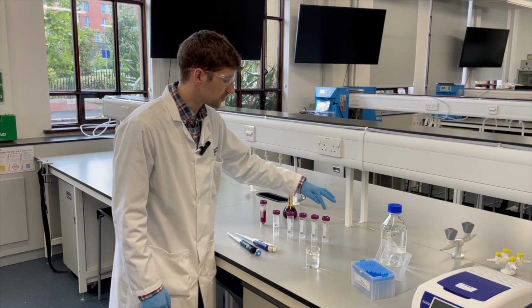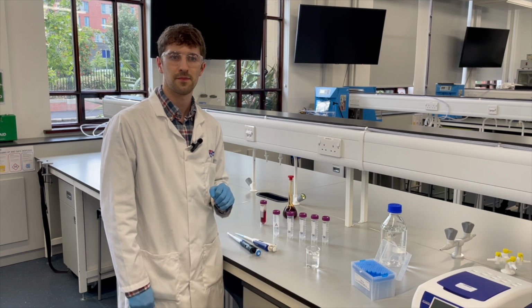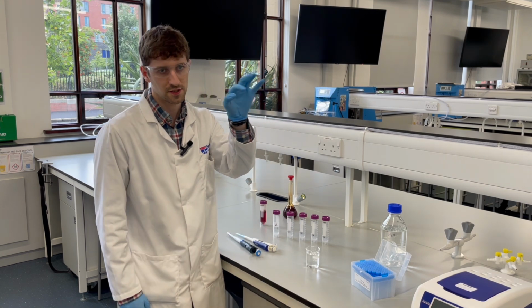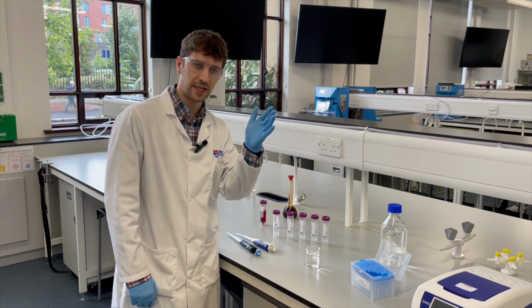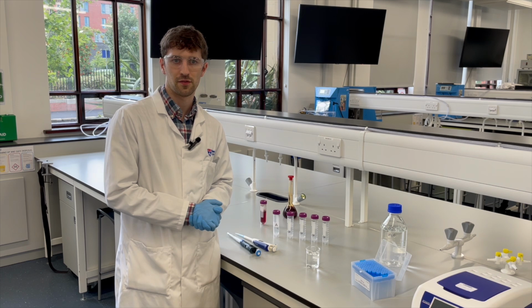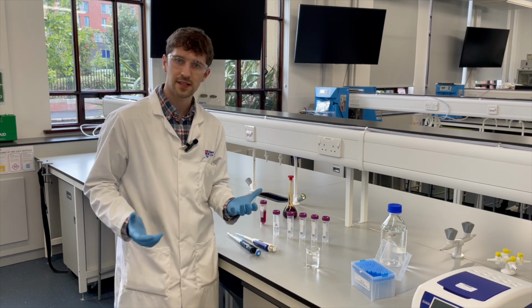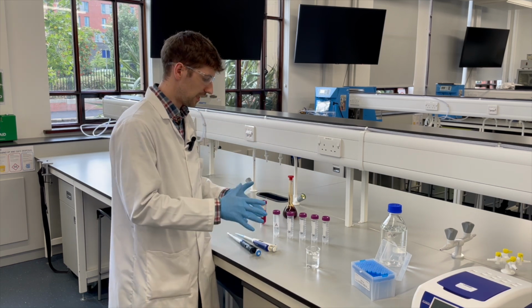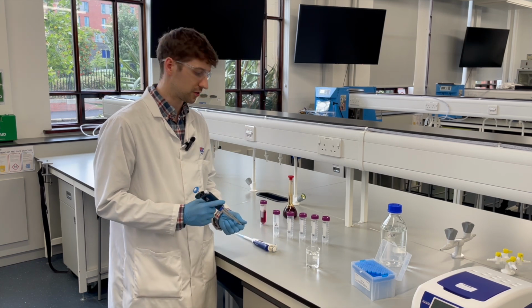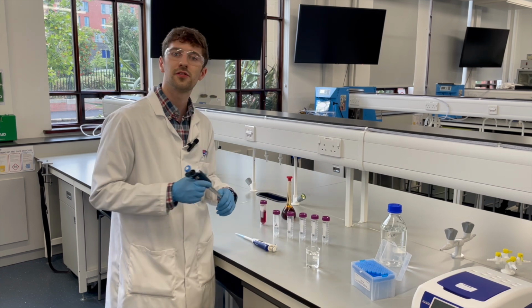And these solutions of known quantity will have their own absorbance reading. We record the known quantity in terms of concentration versus the absorbance value that we read on an Excel spreadsheet, and then we can create our calibration curve, hopefully in a linear plot. So let's get down to the experiment. Let's see how we actually conduct this and construct our calibration curve for this sample of food dye that we're going to dilute down.